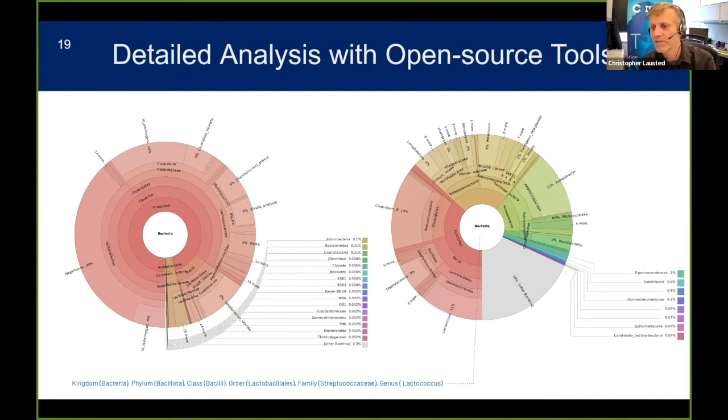The dogs were quite similar, and the cats were quite similar to each other. These microbiome samples taken from pets were quite diverse. This one on the left, although it's almost entirely Firmicutes, it's quite a few different Firmicutes. This one on the right is very diverse.